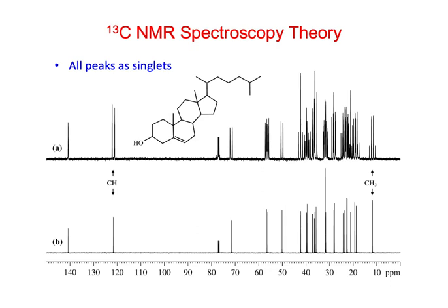One is to simplify the spectrum a little bit more, because as we'll talk about, the one bond coupling constants are quite large, and so you get a lot of overlap of peaks, even though the part per million spread is pretty big as well.